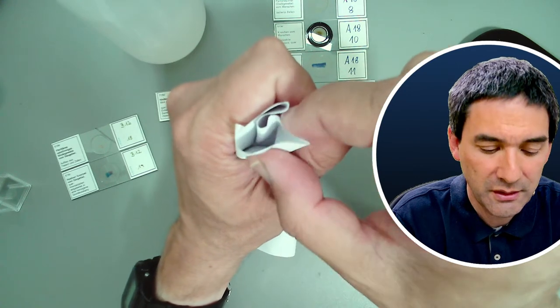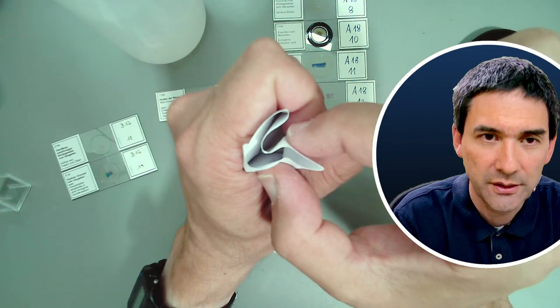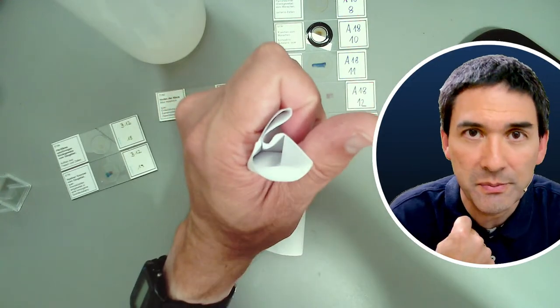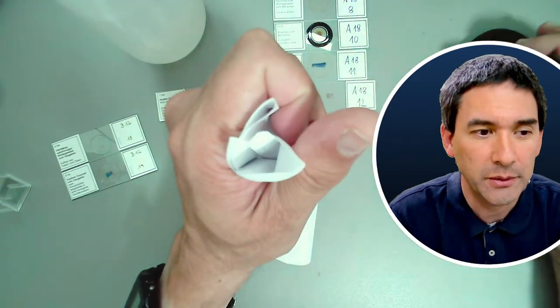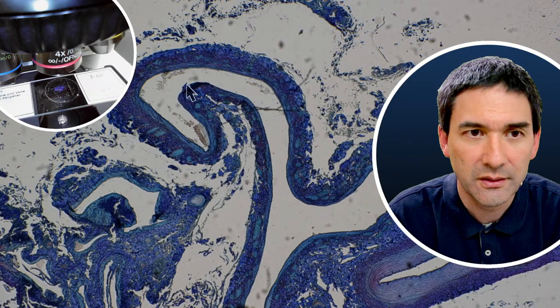Because it's not very strong, this tells you also a little bit about the strength of the blood vessel, and that it actually must be a vein. It is a vein because arteries have to have a very thick wall to withstand the blood pressure. Okay, and this is the reason why it looks the way it does. Yeah.